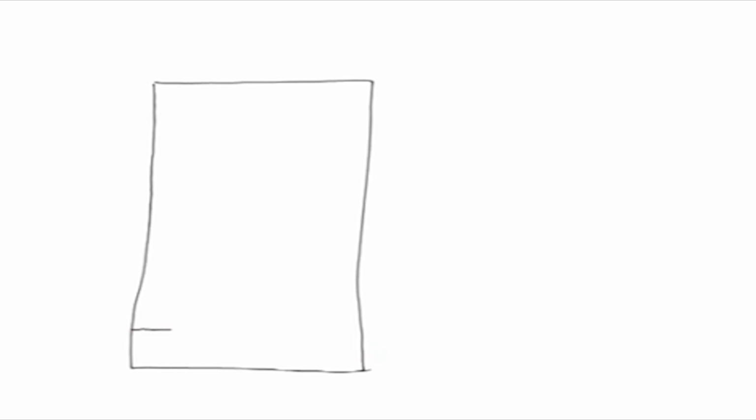What you can do is a very thin line could be drawn or you can do it visually, and here you have to spot your samples, and these spots have to be appropriate or accurate. More than one spot could be placed on a line here on one side of the paper. All right. Once you have spotted this, it could be dried and then the paper could be put in a jar, like I said, a jar containing a shallow mobile phase. Now, let us see what that means.